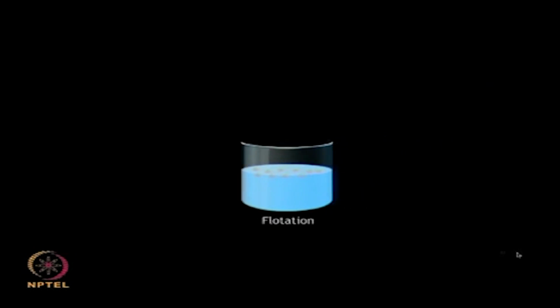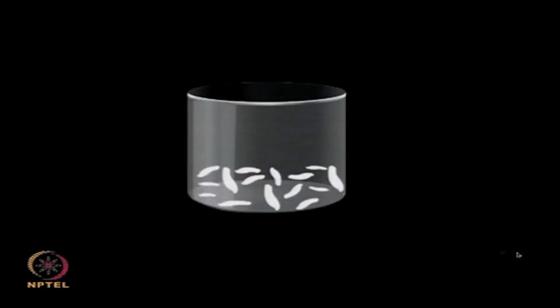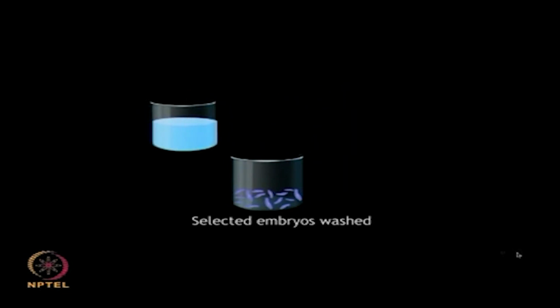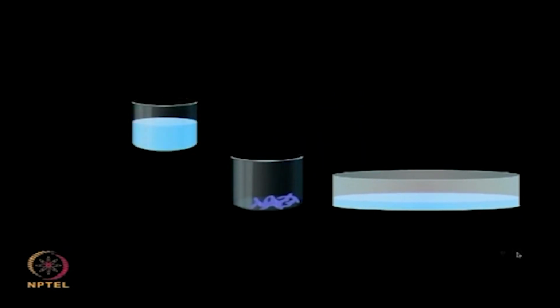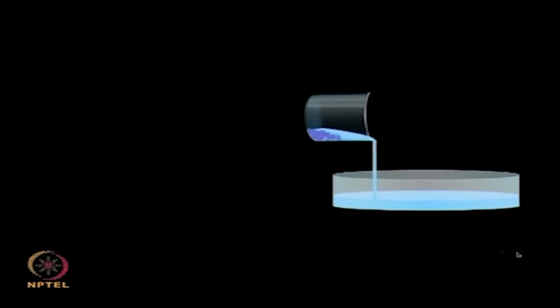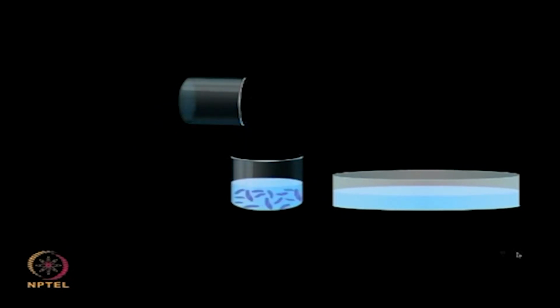After these embryos are floated in the solution, the floating embryos are quickly removed and dried to avoid any damage from the organic solvent. The dried embryos are carefully sorted such that only good embryos without any endosperm coating are selected. One needs to repeat this washing step a few times.